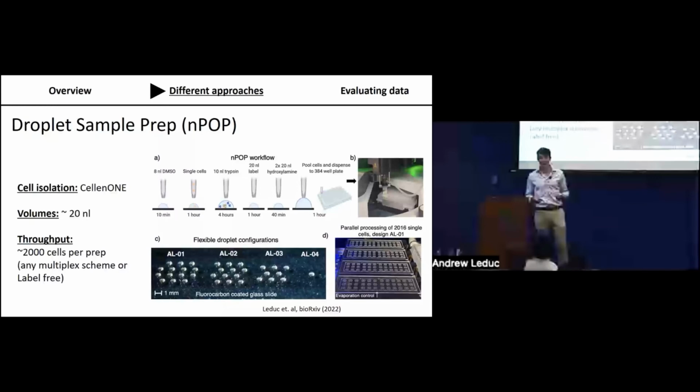We either have times where the peptide is not detected in the run at all, which is missing at random values, and then there are also dropouts due to low abundance. These can be handled differently, but to the extent you can, compute these dimensionality reduction plots with and without imputation and see that your results agree.